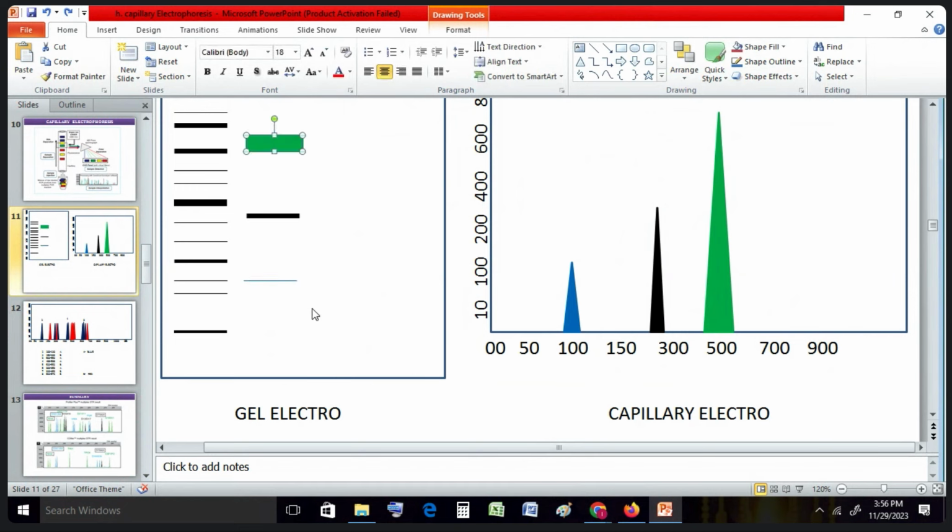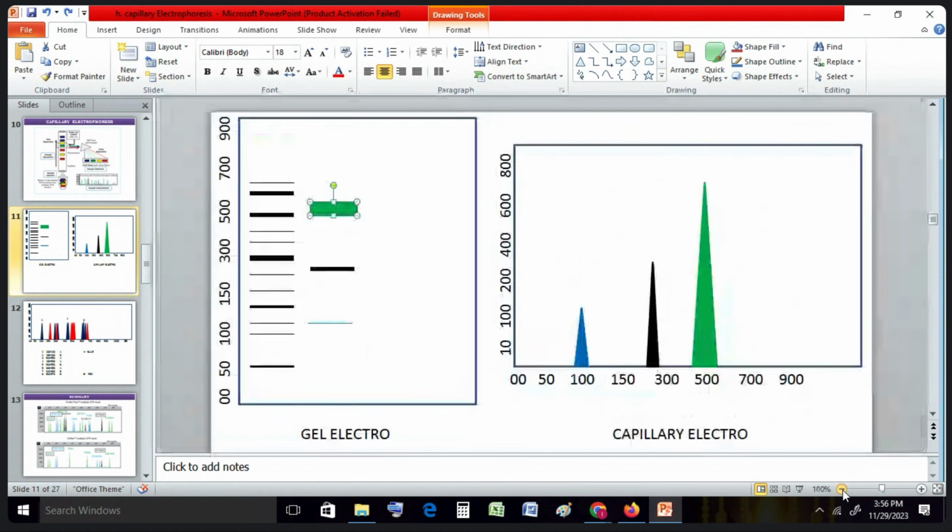এই যে the same thing, the longer or the most long peak, medium size peak, and the shortest peak. This indicates less amount or less concentrated DNA, medium amount or medium concentrated DNA, highest concentrated. That's why it produces more intensity, and in this y-axis you are seeing the intensity. More DNA, more intensity.